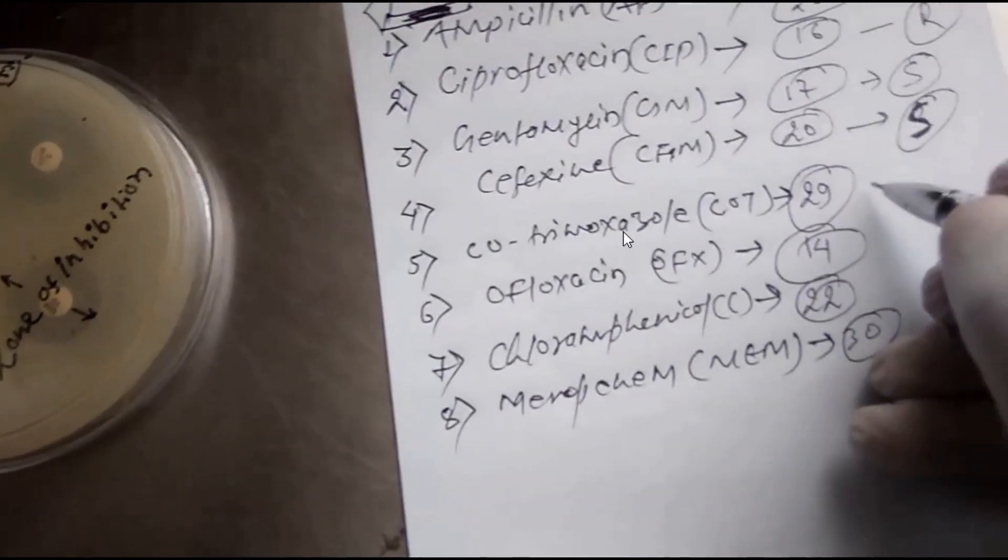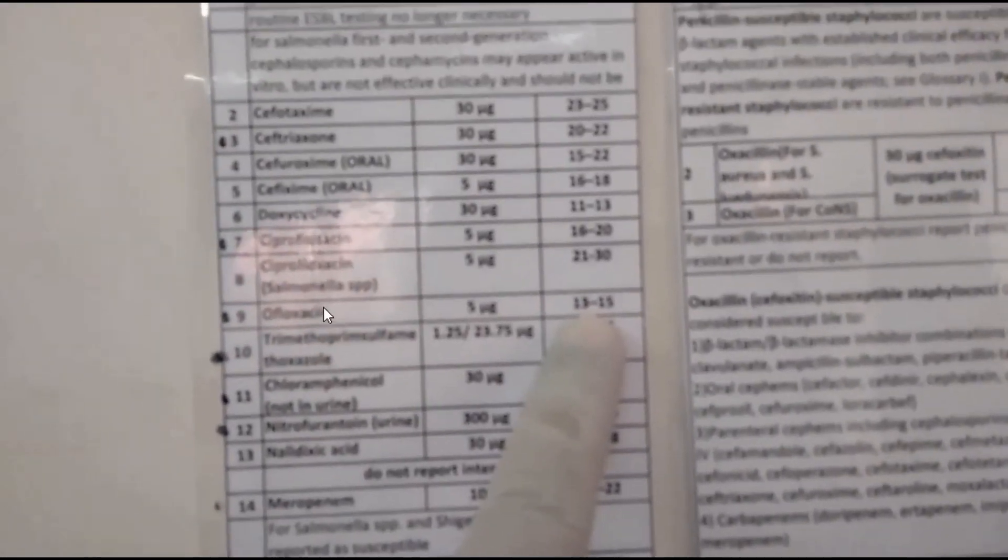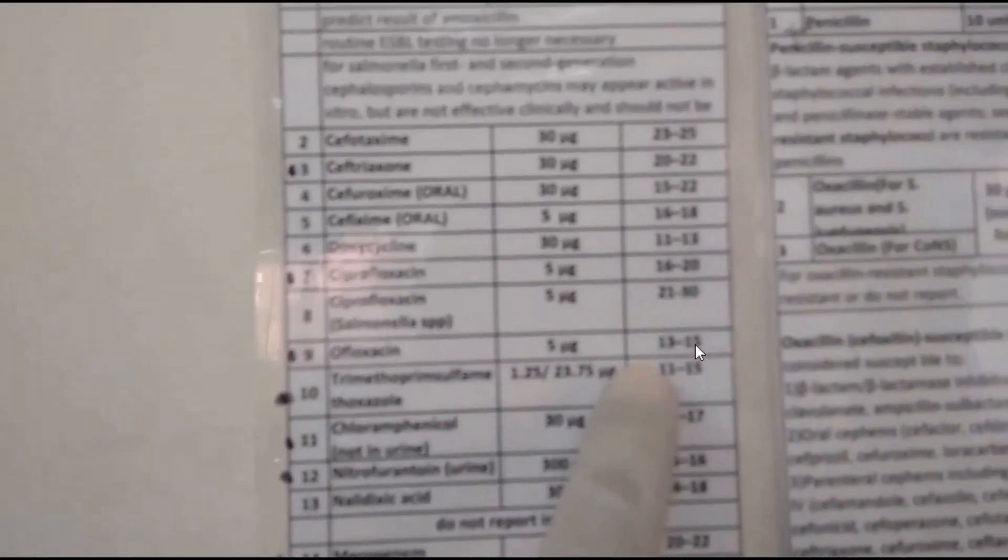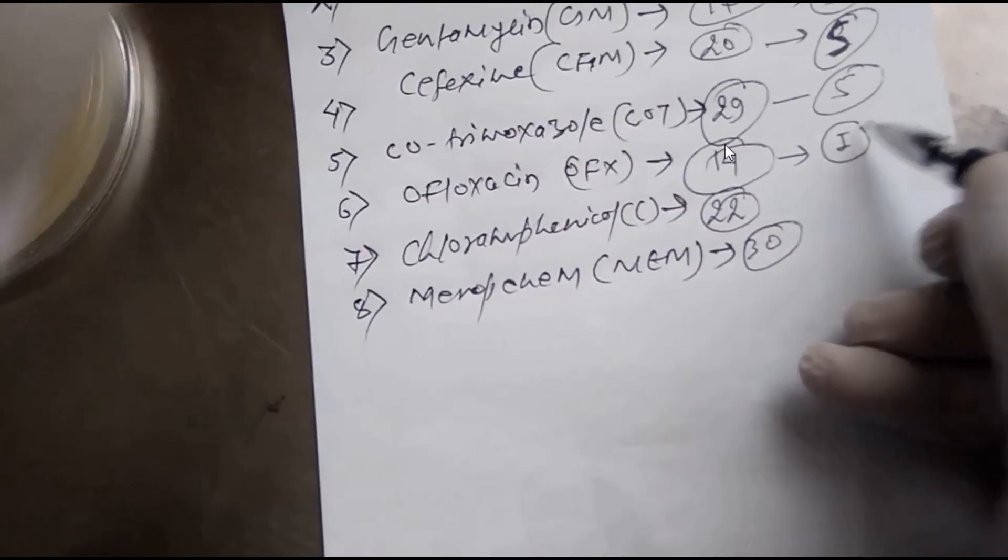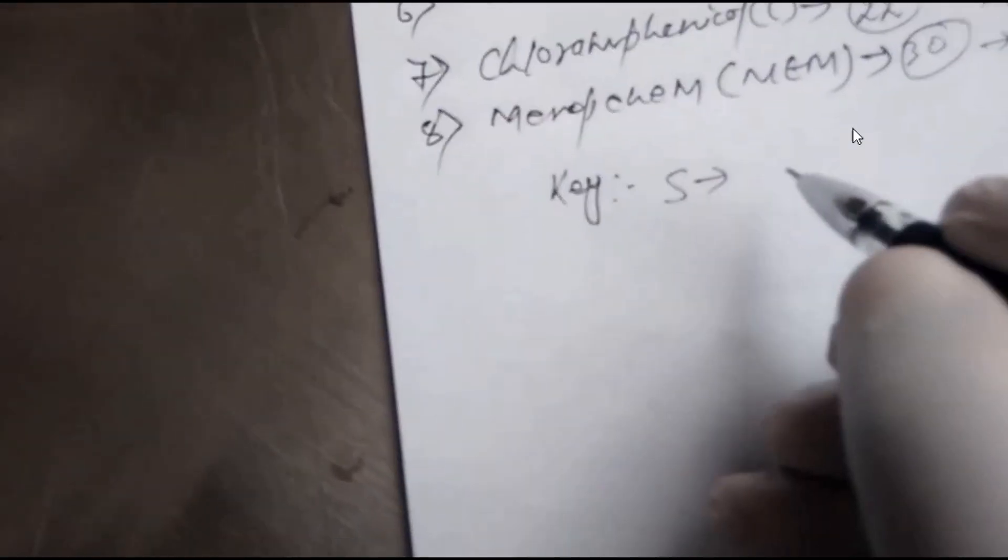For Cotrimoxazole, that is trimethoprim-sulfamethoxazole, it's sensitive. Now for Ofloxacin, this is in the intermediate zone, so that comes under intermediate. That's why I - that is intermediate. S for sensitive.